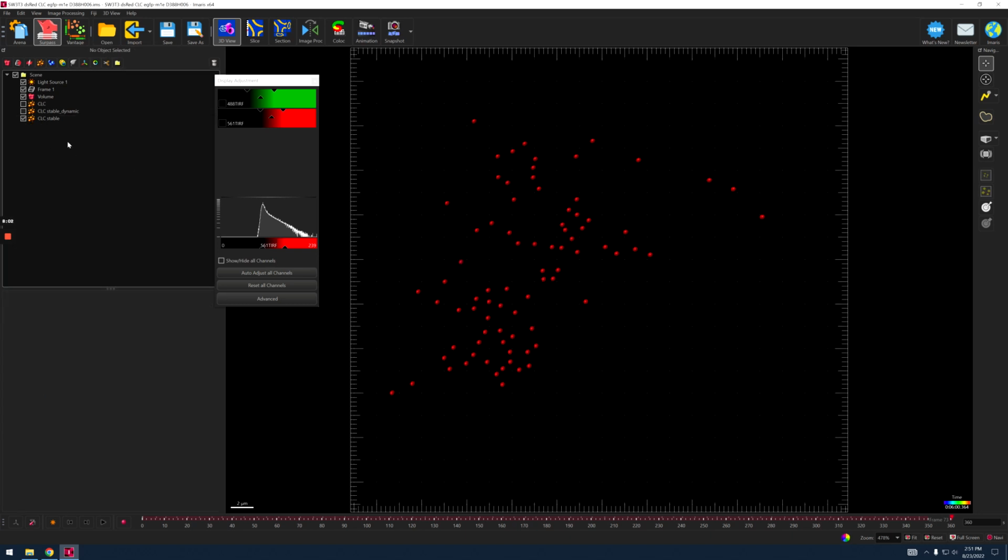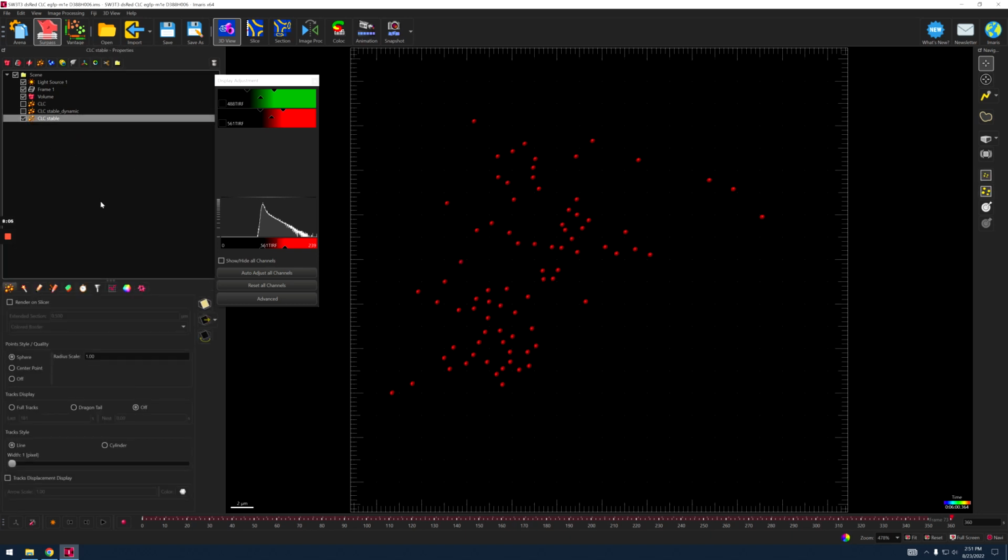And yes, so it will be gone. And now you have a pure module that is Clathrin light chain stable tracks. So you scroll up and down the entire movie, and you see it exists all the way through.